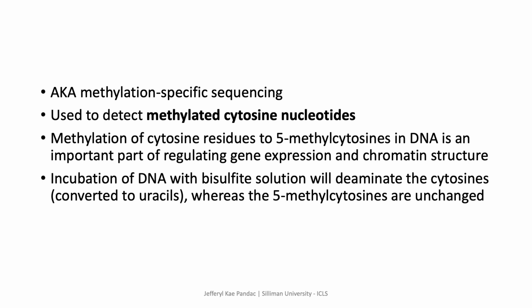Bisulfite DNA sequencing, just like pyrosequencing, is also a chain termination procedure that is used to detect methylated cytosine nucleotides. That is why this method is also known as methylation-specific sequencing. Methylation of cytosine residues to 5-methylcytosines in DNA is an important part of the regulation of gene expression and chromatin structure, affecting cell differentiation and diseases, including several types of cancer.